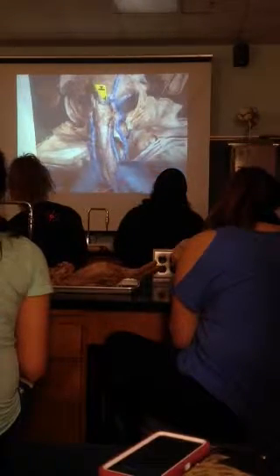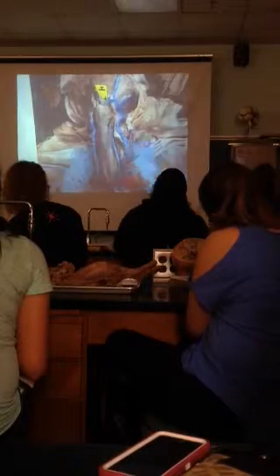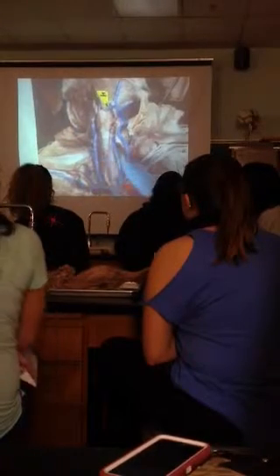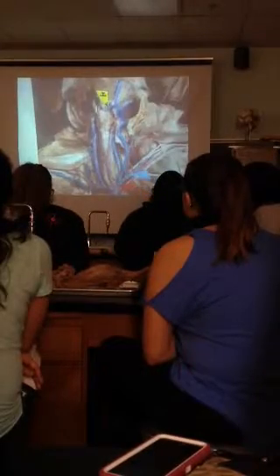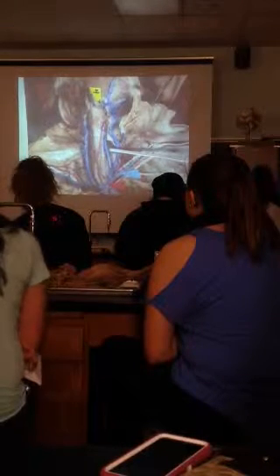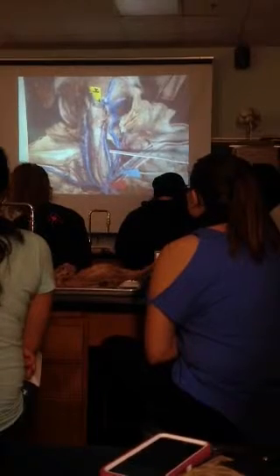And this would be part of the jugular vein, but wait, there are 2. There's an external jugular and an internal jugular vein. So there you go, there's 2 more points, okay? External is this one that's all the way along the side, and internal, this cat actually has what's called an anomaly. Its internal jugular, right here, is huge. It's not supposed to be that big. So this internal jugular right there, it's kind of weird how big it is, but most of yours will be smaller. So you can say that, external and internal jugulars.